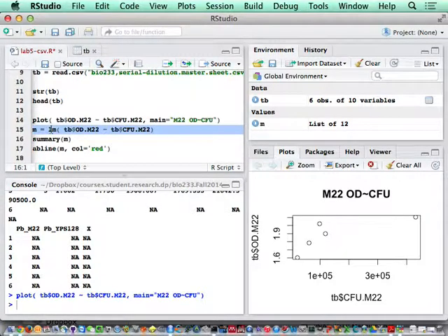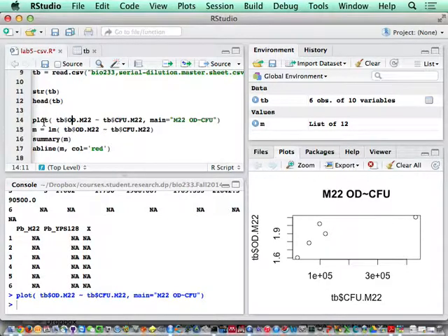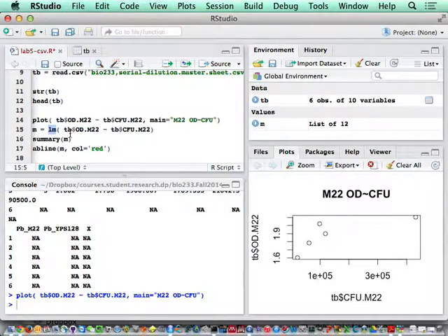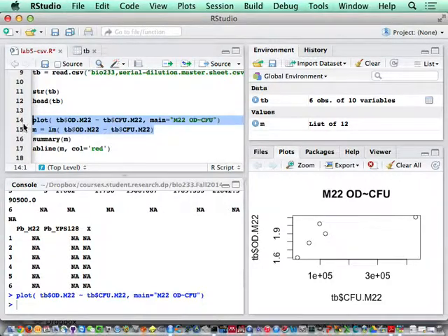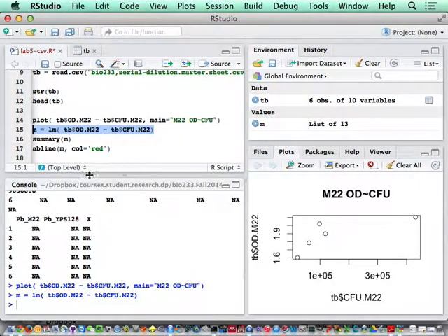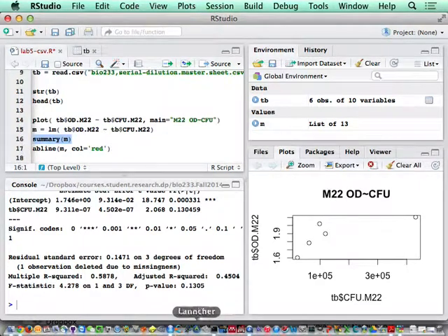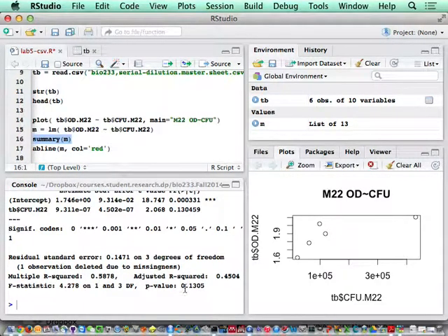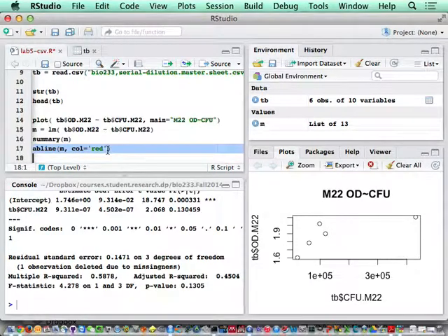lm is a command for linear model regression analysis. I did a plot first at line 14. At line 15, I'm running a linear regression model for optical density OD M22 value versus CFU for M22. I highlight that, run it, and line 16 displays the result of the linear regression. The r square is 0.6, p-value 0.13. It's not very good correlation, but it's reasonable.